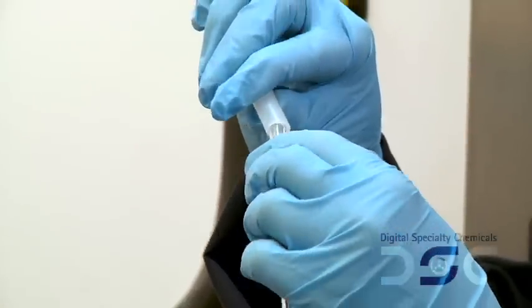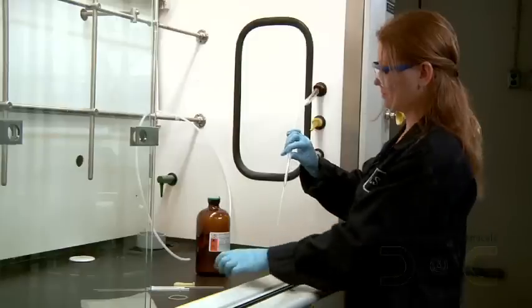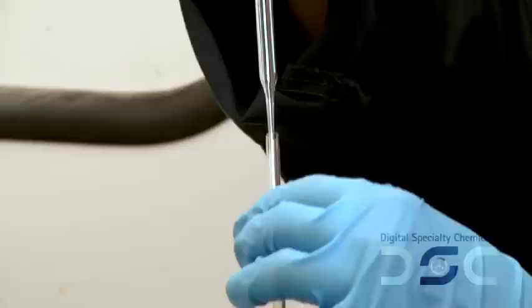First, attach the wide end of the pipette to the nitrogen line. To prevent injury, take extra care not to break the pipette. Purge the pipette and vial or NMR tube for 30 seconds.